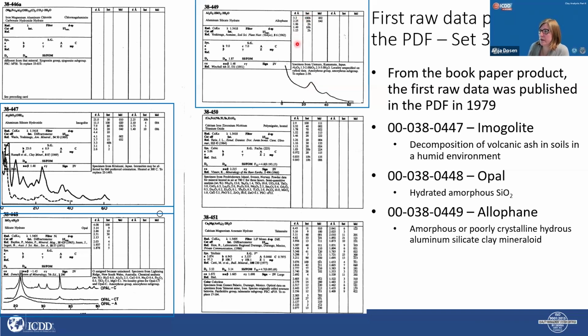This here is the DI list. You see the list of D-spacing and the list of intensities. Other than that, we had opal, which is very cool. We had 3 different raw data patterns drawn, which, as you can imagine, was incredibly useful. Having opal A as an amorphous, opal CT as partially crystalline, and opal C as a crystalline phase.